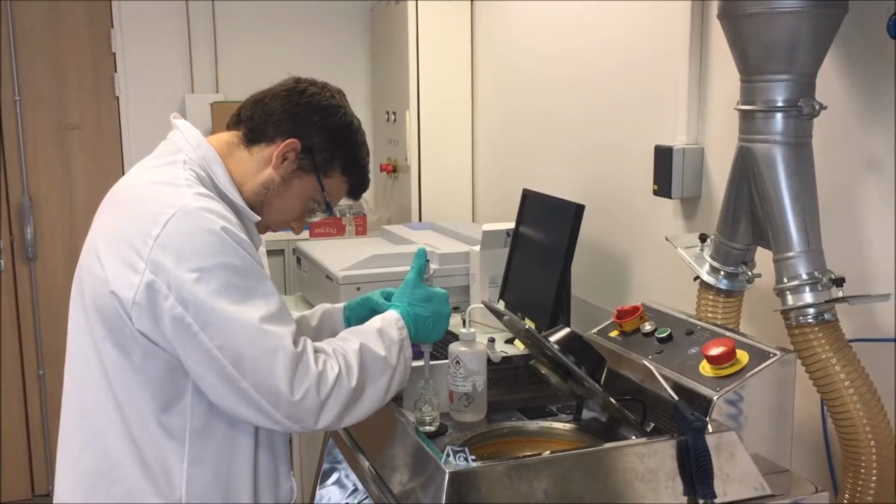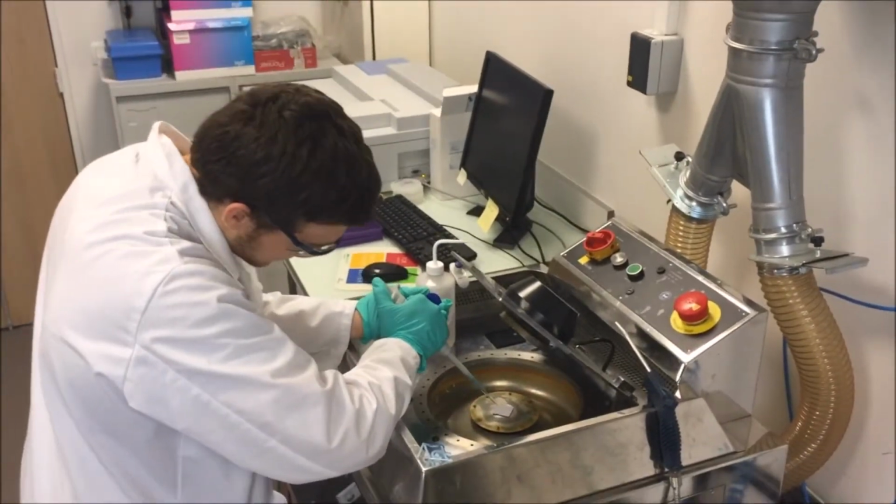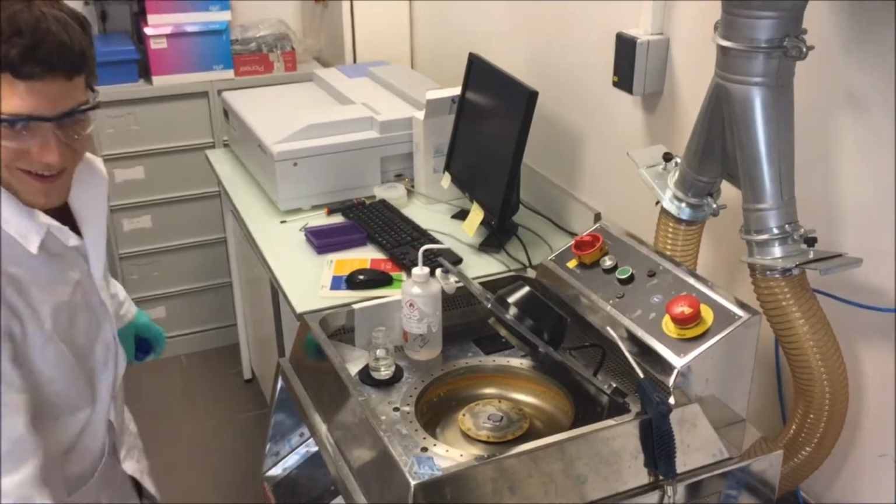There we go. Very carefully place it on the substrate. And let her spin.